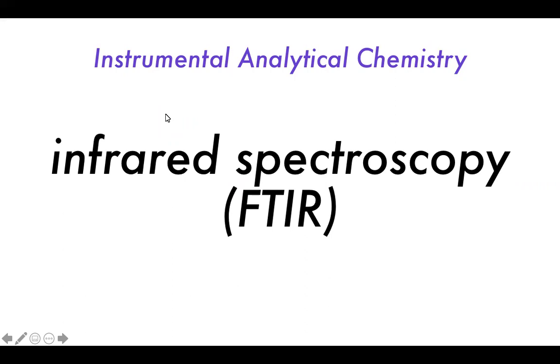Here today, we'll be talking a little bit about the ranges of infrared spectroscopy, especially getting on to where it applies to the mid-IR. So these transitions typically are much lower in energy than the electronic transitions we saw in UV-vis spectroscopy, but that does not make them any less useful. They are in fact very useful, and in some respects, FTIR and infrared spectroscopy in general is one of the most useful techniques in correctly identifying a particular molecule, especially if we need it to be done very quickly and we need a high degree of accuracy.